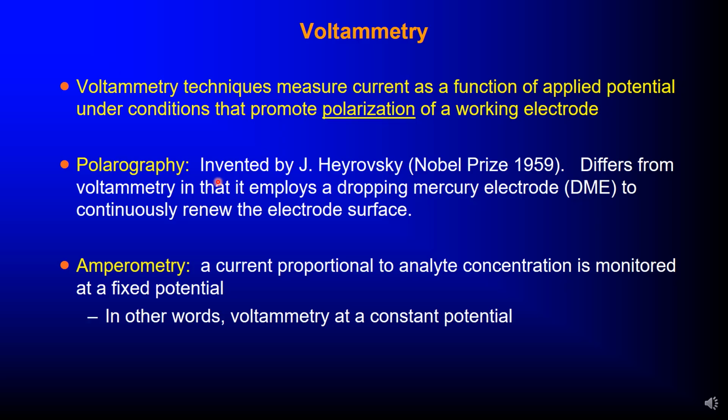Usually, this current is proportional to the concentration of the analyte. So it's a sensitive electroanalytical technique that is especially useful for trace analysis.